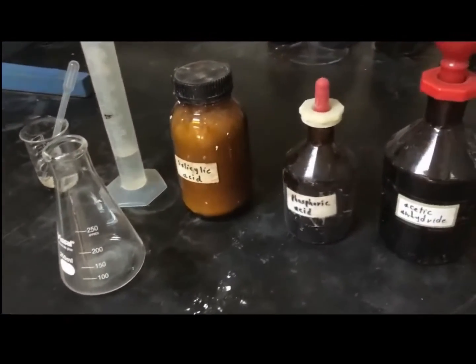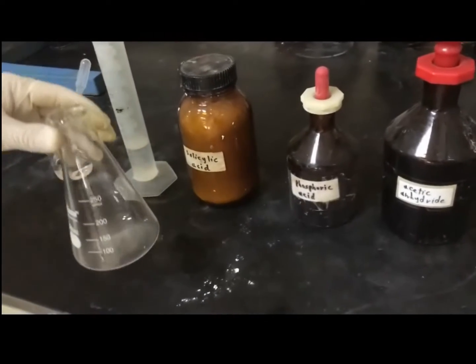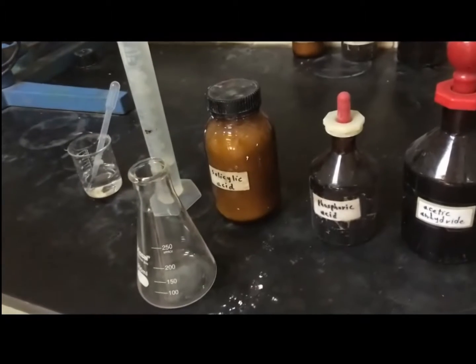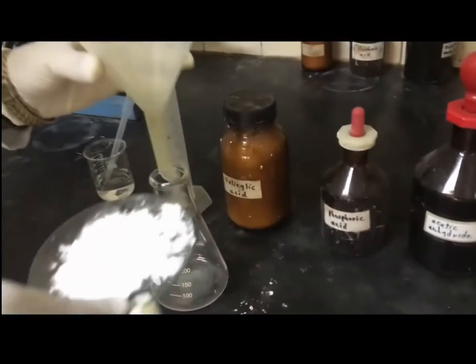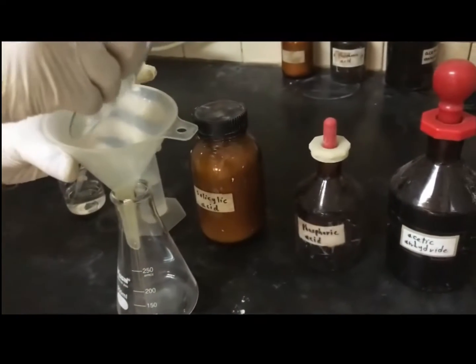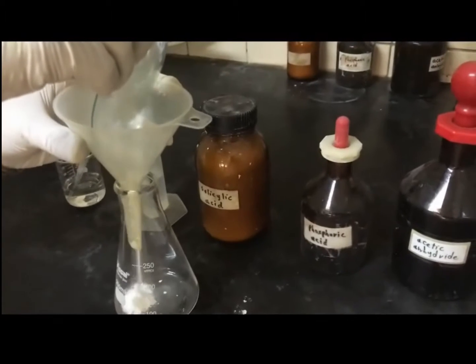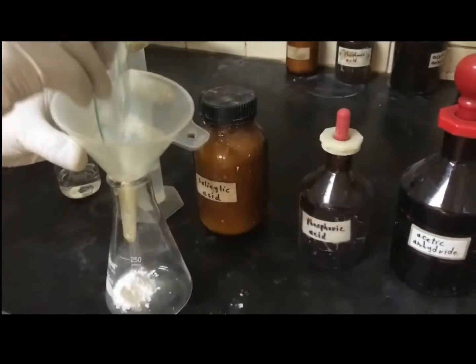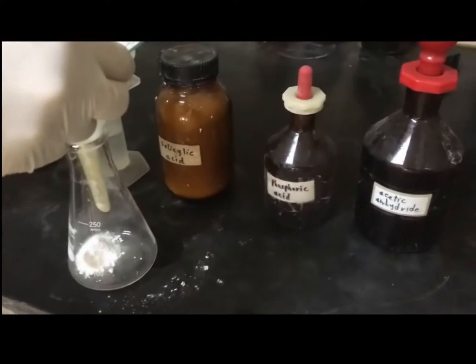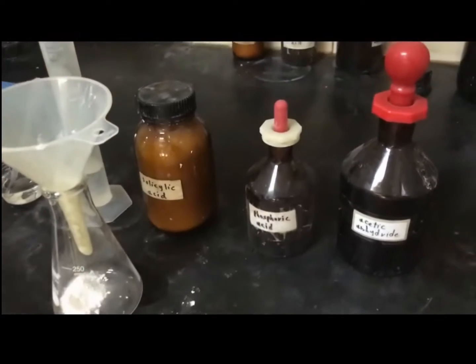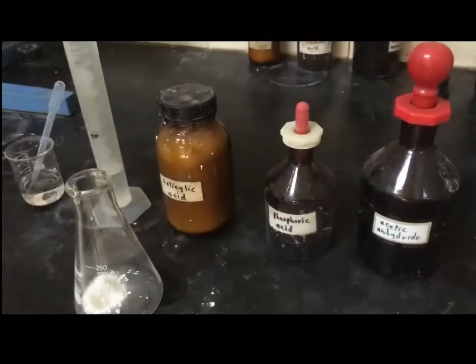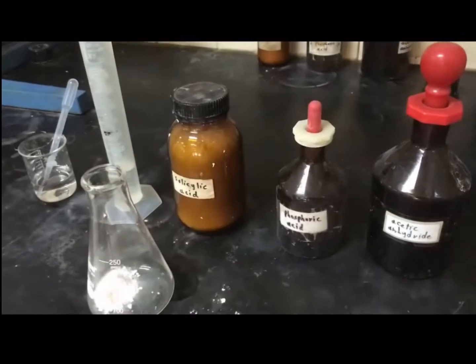Start with a 250 ml Erlenmeyer flask and add 3 grams of salicylic acid. Now add 6 ml of acetic anhydride to the flask and shake the mixture.